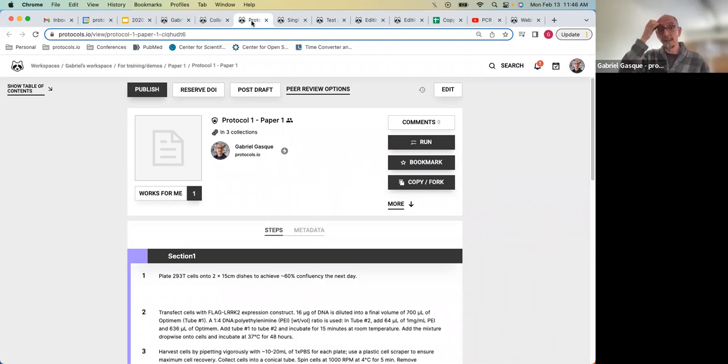If that is what you mean, our recommendation is that you do step-by-step as much as you can, because that way, future users can very easily fork your protocol and just modify a single step if that's the step they want to optimize, without having to rewrite everything down again. And also the step-by-step format of protocols.io is the only one that is runnable on the computer or tablet.